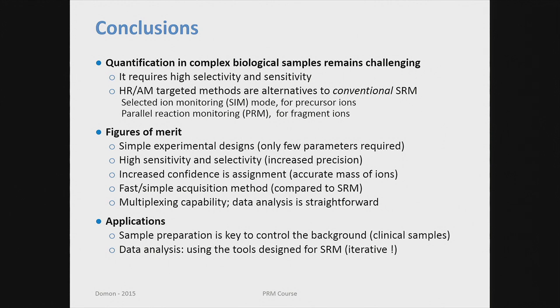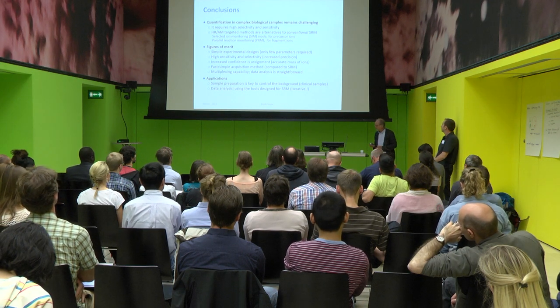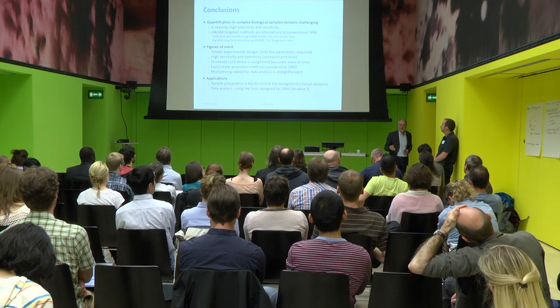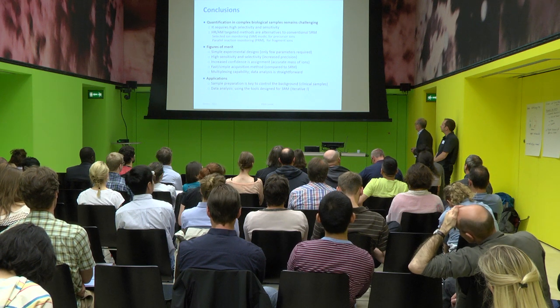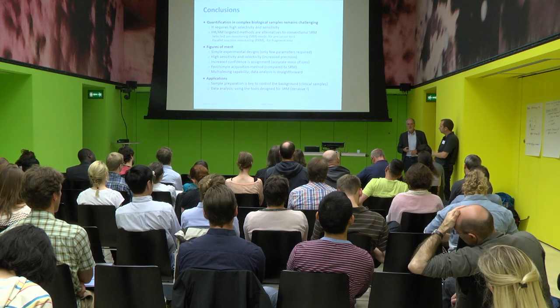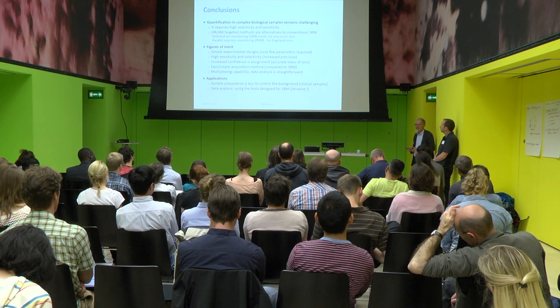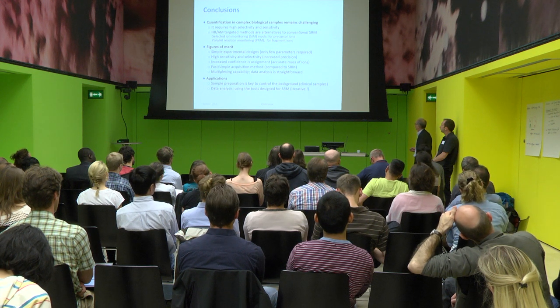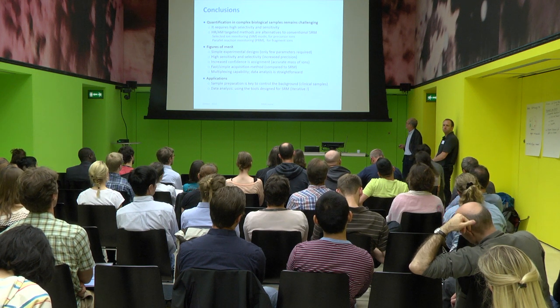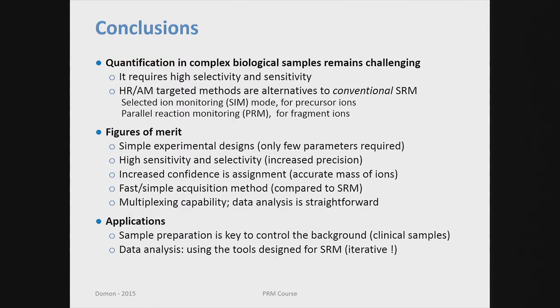I think the key issue which remains, with the instruments getting better and better, and the ultimate problem, which was also alluded to in the previous session, if we now really want to be quantitative, is sample preparation, the internal standard, and losses, and other things. The instruments are getting better and better. We solve a lot of problems, but eventually, if we really want to be really quantitative, we also have to address the very upfront, which is the sample preparation, and how we prepare the sample.